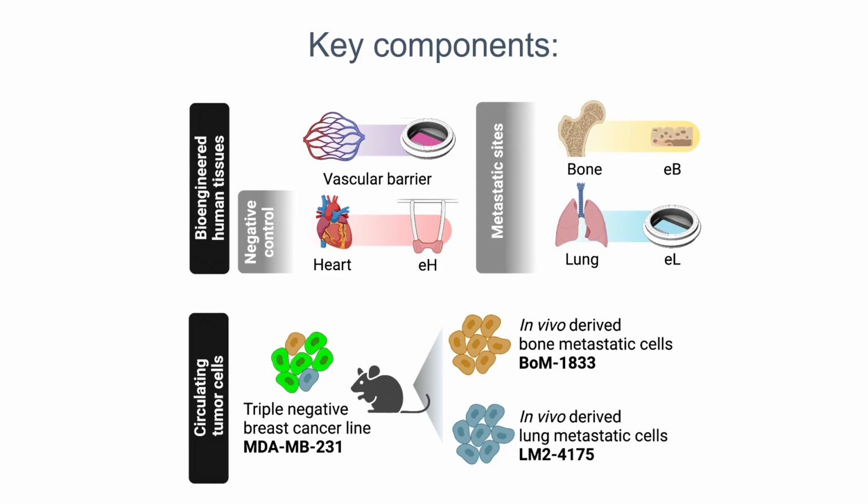And the work that I'll show you now was done with the lines of cells that were developed by John Massagué, and he was kind enough to make them available to us. So he developed a line of triple negative breast cancer cells. This is the well-known MDA line that was broadly used, very well characterized. He has done something else which is very important in a mouse. He was introducing MDA cells into the mouse, and then some of these cells would go into bone. They're universally metastatic.